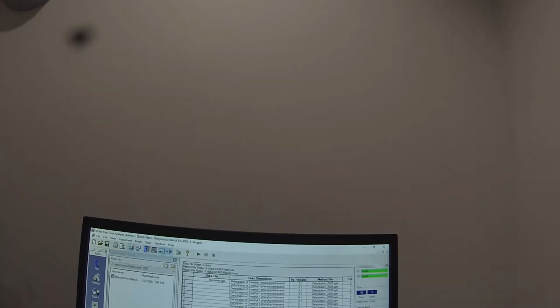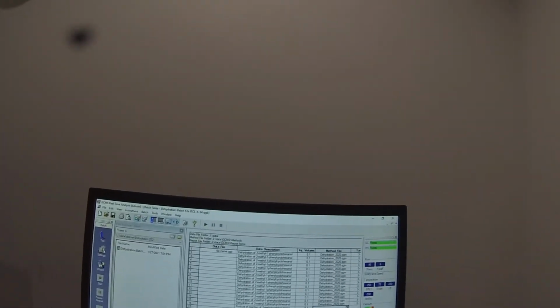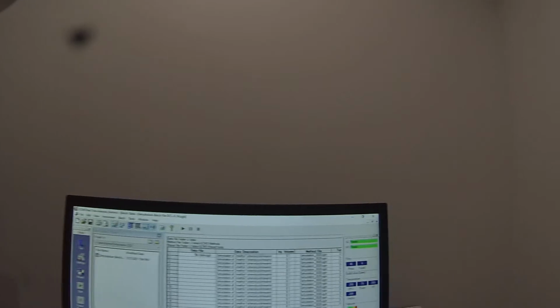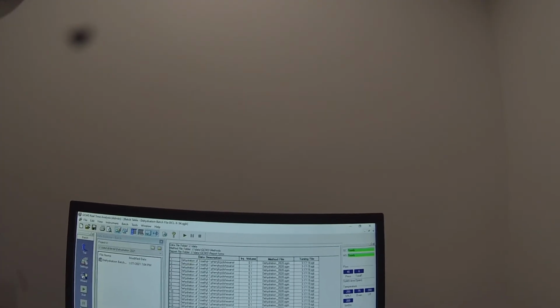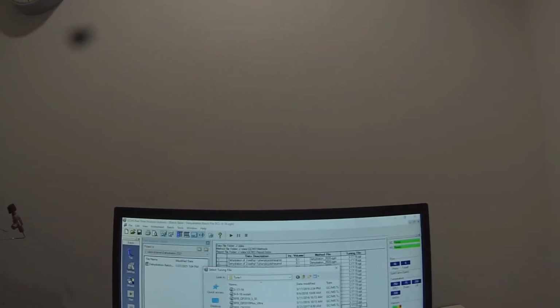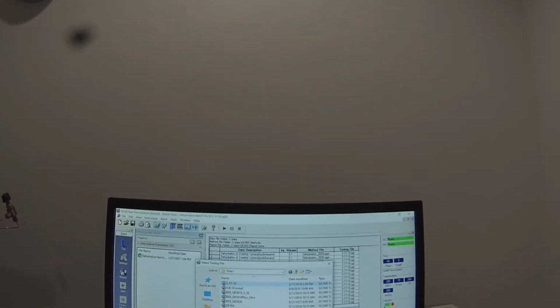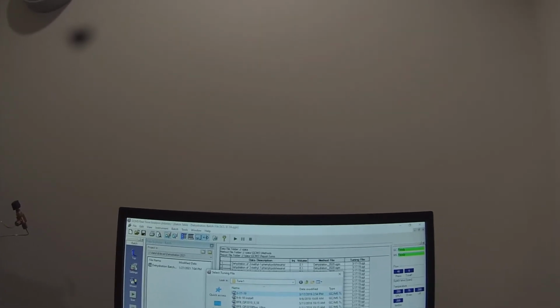And then if we scroll over, the method file is dehydration 2020. I'll just insert that into the next two rows. And then the tuning file is the most recent date, and that's still 3/17/19. So in this case, I will just add that tuning file. It hasn't been tuned since then. That's not what I meant to do. There.